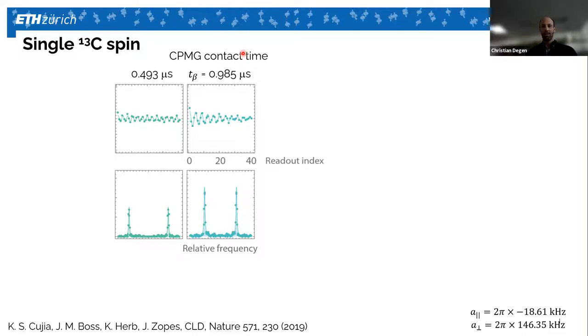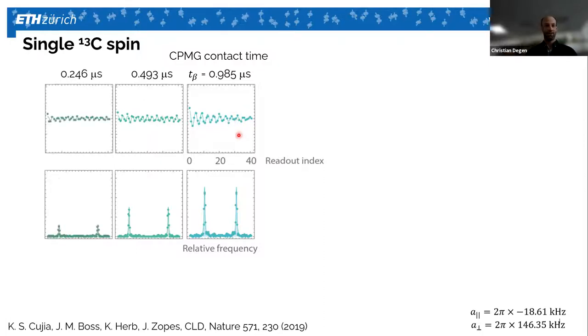And what you see is that we have less signal, the oscillation is less high, but it persists longer. So this means we're detecting less effectively. Our detector is not as good anymore, but we don't disturb the nuclear spin as much because there is decay here, there is no decay here. I'm going to make the point that the decay here is actually radiation damping, or more generally back action. You can go the short way and you get even less influence. The spectrum is very narrow, but the peak is small.